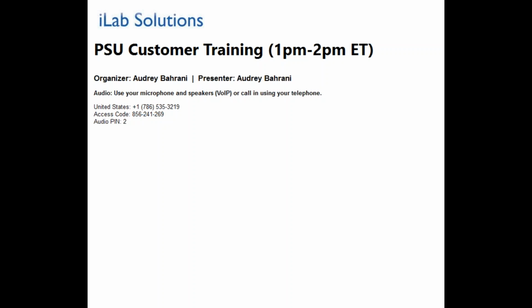So what I want to do with you guys today is just give you a demo on how to interact with iLab. You have been identified as users that some of Penn State's cores are basically intending to have as customers. So iLab is basically going to allow you to log in, create reservations on pieces of equipment, and submit project requests if maybe you have a core that you would typically submit samples to.